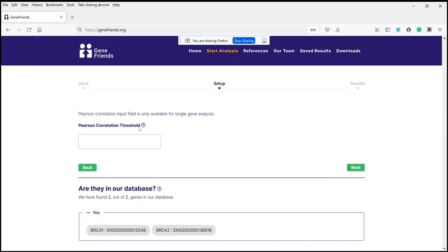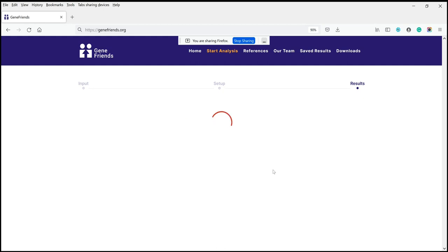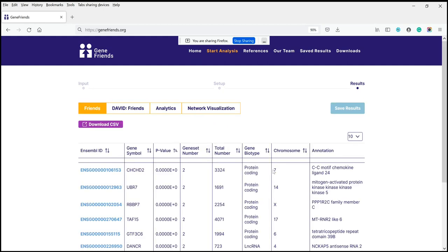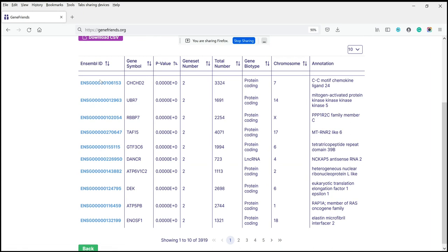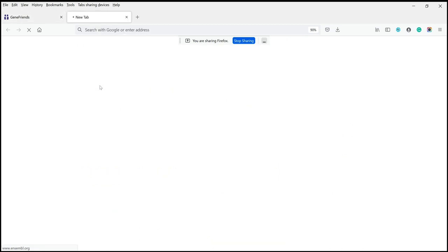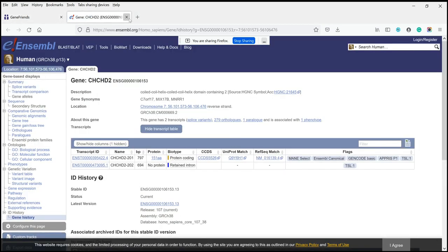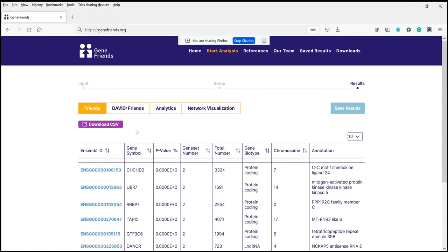The Pearson correlation threshold is only used for single gene analysis. If you have more than one gene, you don't need to input it. Then you click Next and it will give you the genes that are co-expressed with BRCA1 and BRCA2 — these are the results, the gene friends of BRCA1 and BRCA2. You can explore each of them individually and click through to Ensembl for more information about genes co-expressed with BRCA1 or BRCA2.